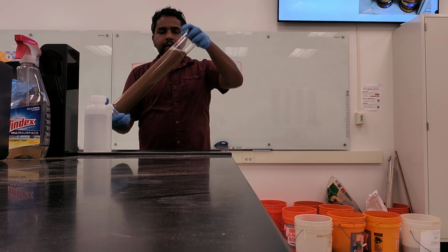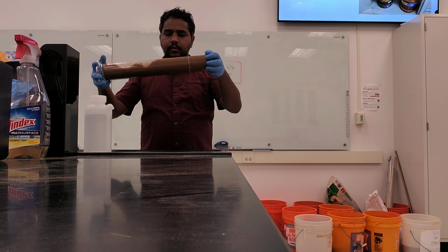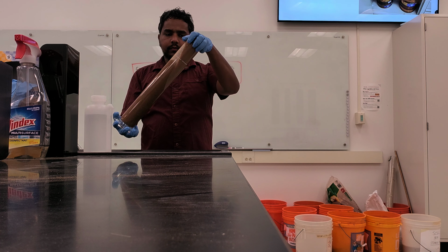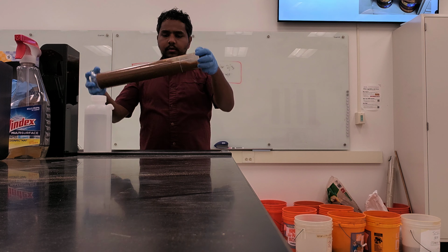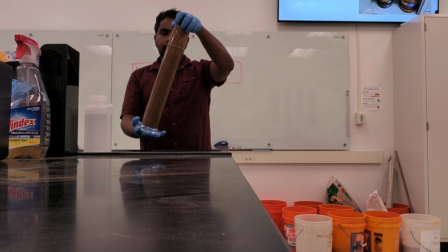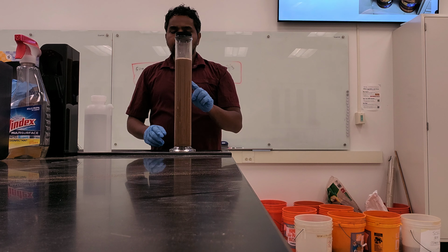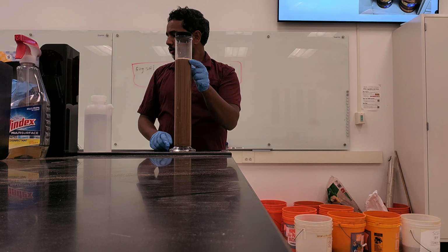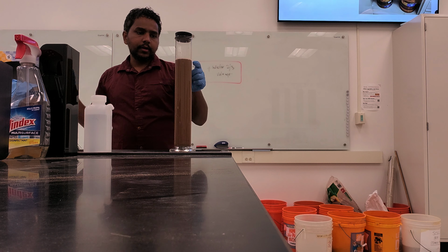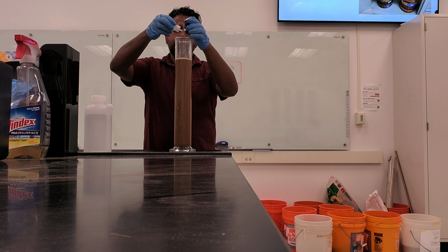Now you can gently mix it a few times. And if there is an air bubble, you can use isopropyl alcohol to get rid of it. 1 or 2 drops would be good.